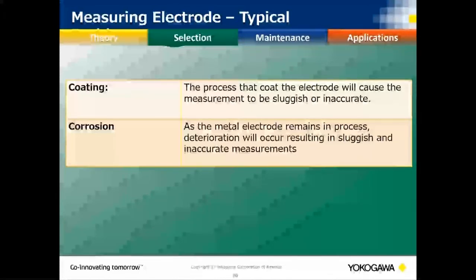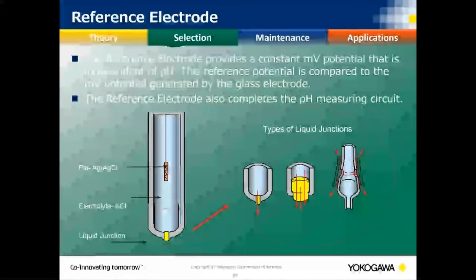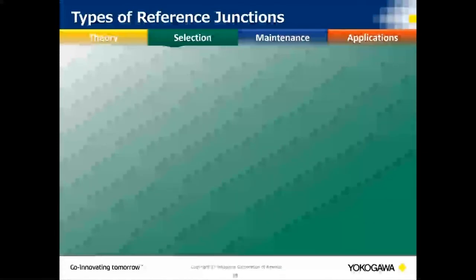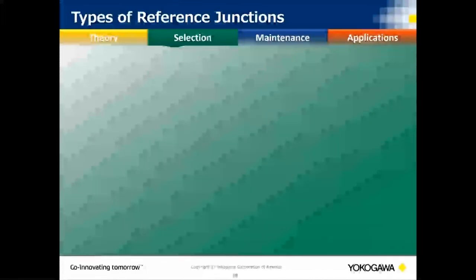Typical problems with ORP include coating of the platinum metal over time with process buildup, and corrosion. If the application reacts with platinum or gold, make sure you have the right metal. The reference is traditionally the same as a pH reference, so any problems — coating, plugging — will be the same. We need the right junction type, the right reference internal fill solution, and proper cleaning.